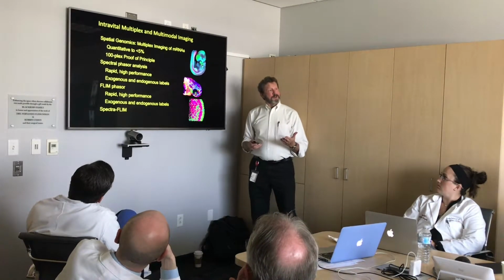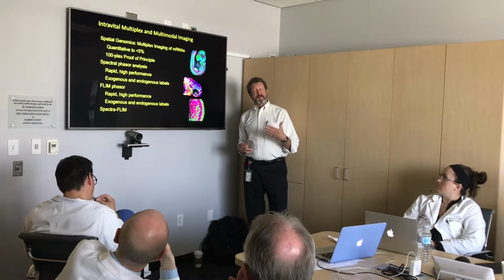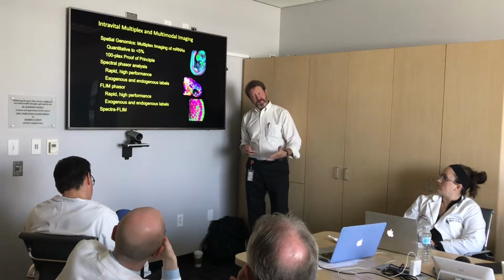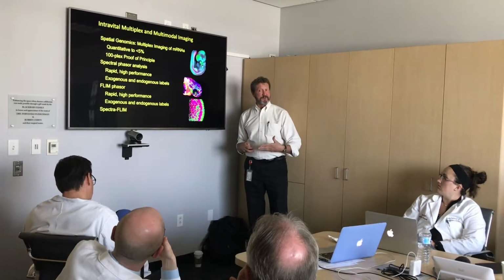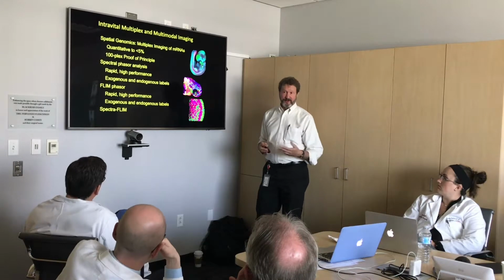So what we're hoping to do now is to try to apply this to a number of different settings. We want to try to make a hyperspectral lifetime imager that might look below the surface and see the earliest antecedents of a foot ulcer or anything else.